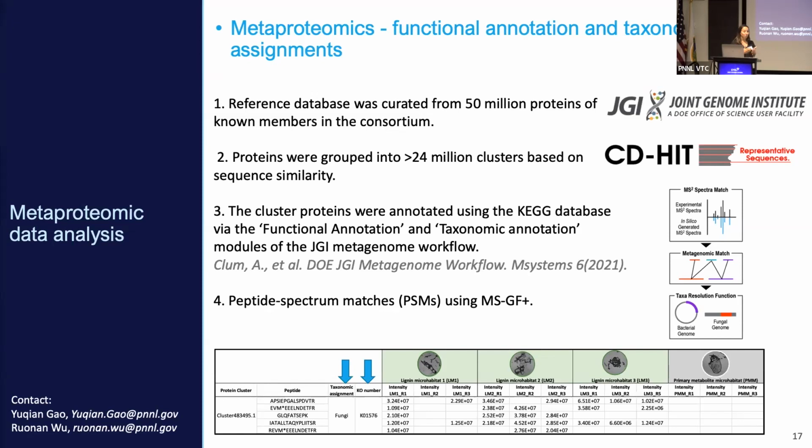Then the previously acquired mass spectrometry peptide data was compared against our custom database using the MSGF plus search engine. That search engine first matched the MS1 within 20 ppm, or whichever tolerance your instrument allows, but in our case we used within 20 ppm. For all MS1 matches with our reference database, we then compared our fragmentation pattern and obtained a probability score for each peptide spectrum match.